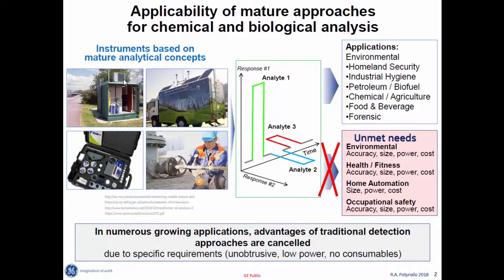Okay, so you wish you had some smaller instruments because you would like to put those instruments maybe as wearable devices, okay, or maybe on a drone, or maybe to have them at home, or to have them in every processing plant, but they are too big, they require quite a lot of infrastructure, and therefore you wish you had the sensors that will be as good as those.